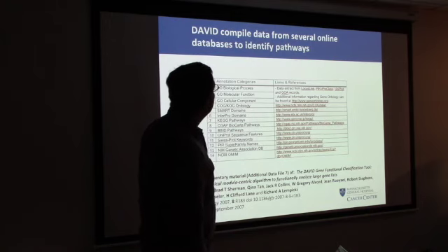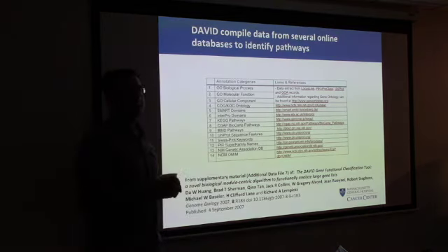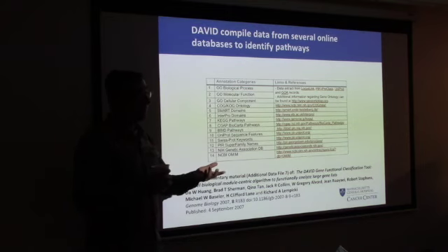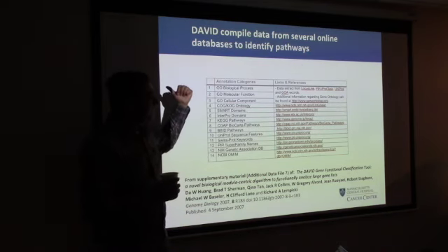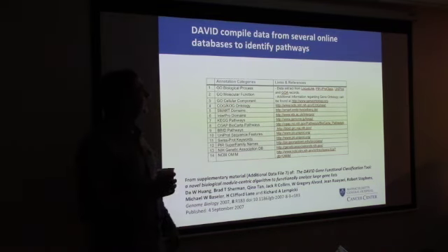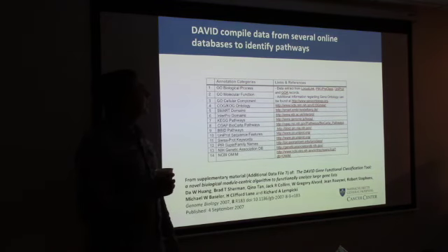So here are the Davids. Just like MSigDB is the data set or pathway gene set for GSEA, David uses all of these data sets to identify pathways.